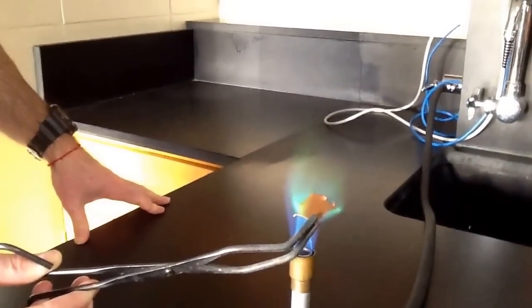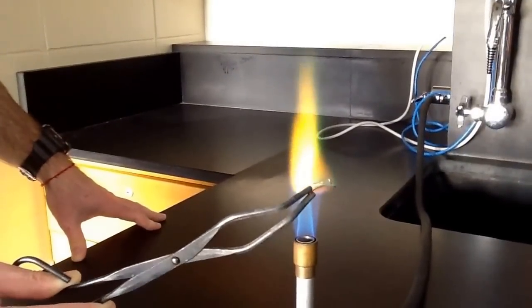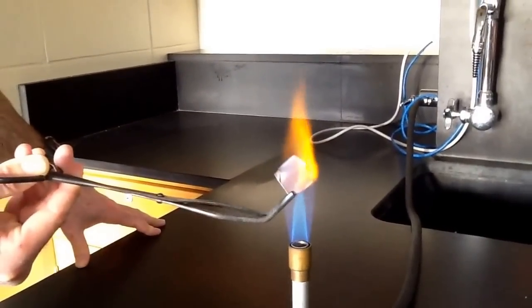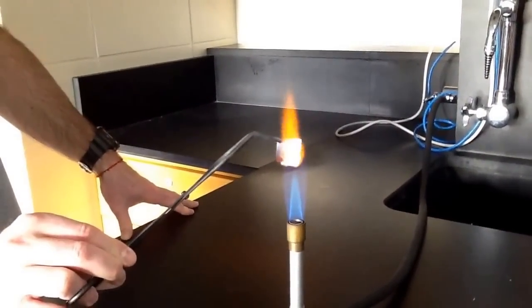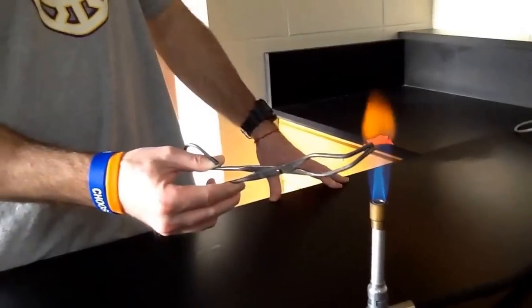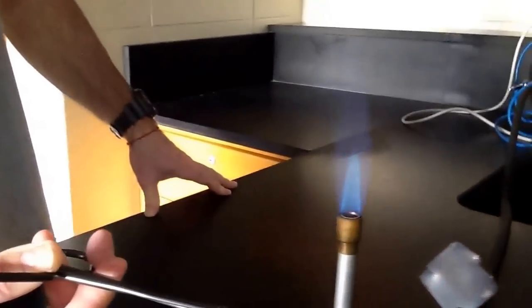And I think what you can see now is a nice green color that forms when you have a reaction with copper. Sometimes you get a nice green color that forms. This happens with some different flame tests as well. So it's another little interesting fact about when you heat copper up. If you see some different light forms and it's green, most of the time it's going to be copper that you're heating up.